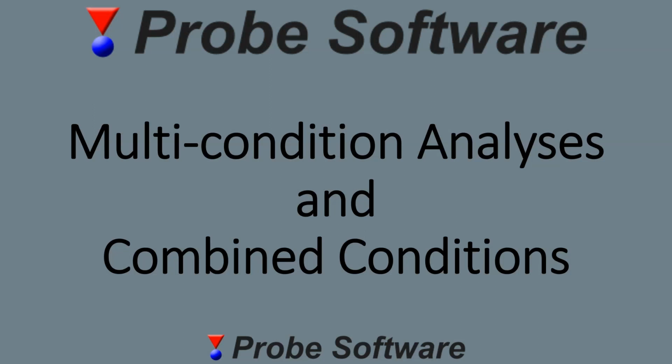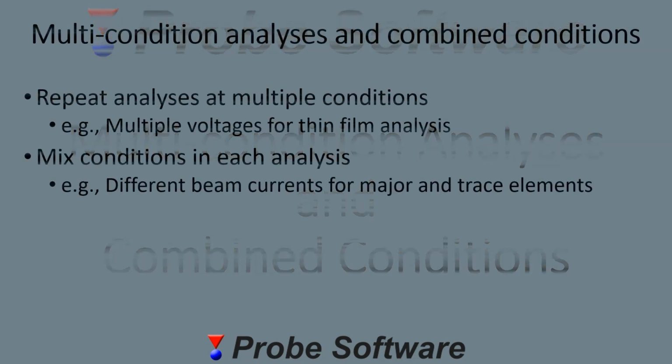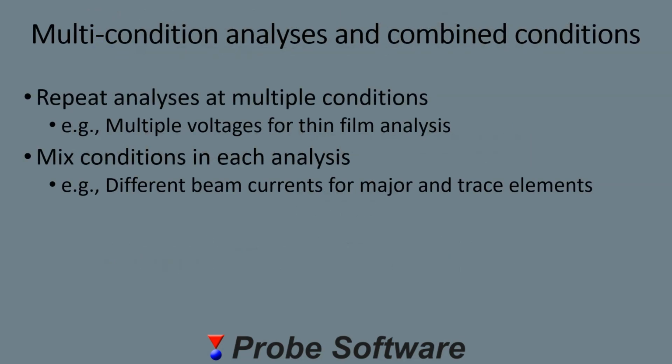In this tutorial, we're going to look at how to use Probe for EPMA to apply multiple conditions to your analysis points. There are several reasons why you might want to do this. For example, you might want to repeat analyses at multiple conditions, such as repeating analysis points at a range of voltages for thin film analysis.